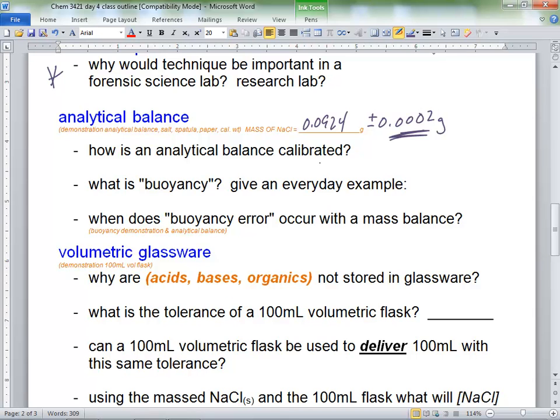Oh, yeah, I got to get this on there. Oh, I can't close it. Well, let's just make sure he's tared. We'll just have to leave the top open. We're just kind of stuck. Don't blow on it. Nobody blow on it. Yeah, everybody stop. Stop breathing.